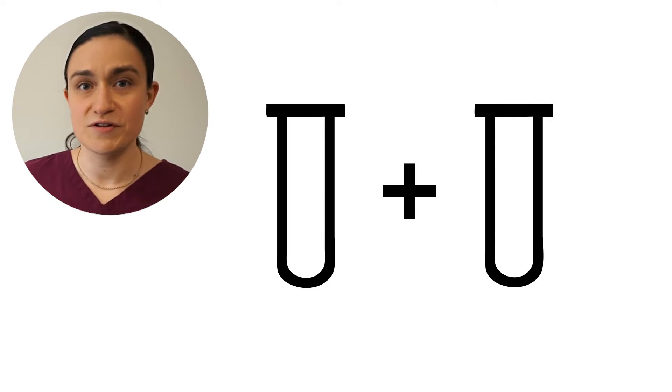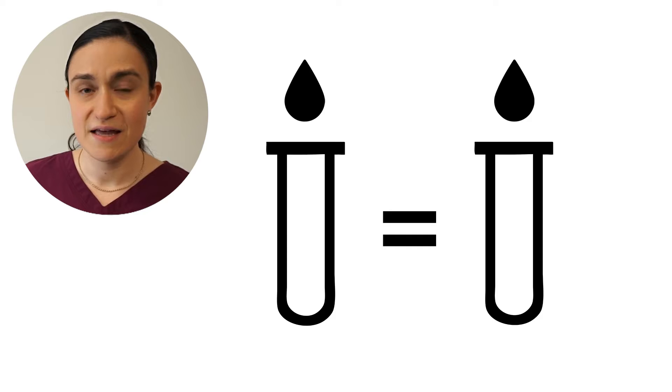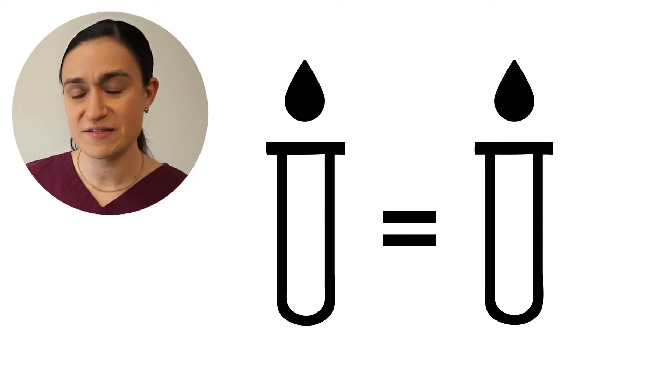Whenever you spin tubes in your SARA-12, you should always make sure the tube load is balanced. It'll help keep your centrifuge running for years to come, and it'll make sure that you get the best results out of every spin. Your first step should be to make sure the tubes themselves are balanced — that means an equal volume of liquid in each tube that you're going to spin.